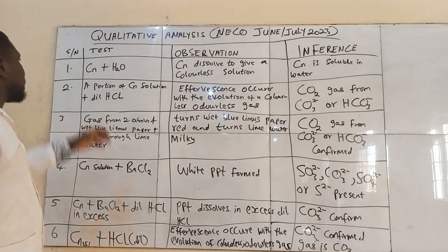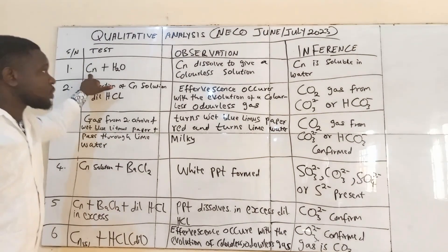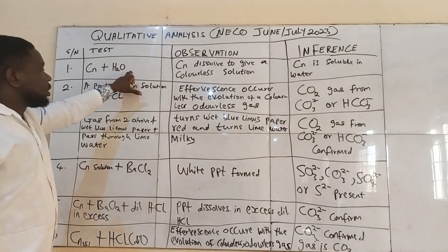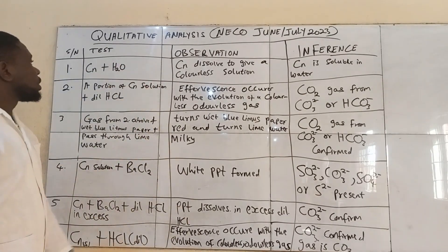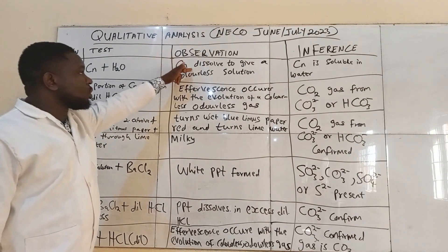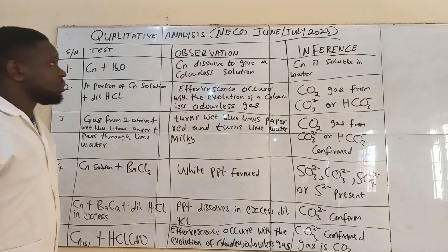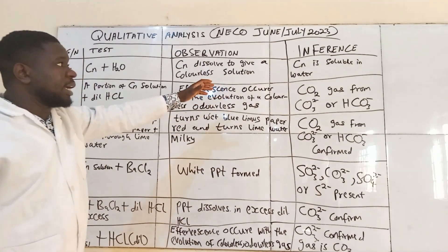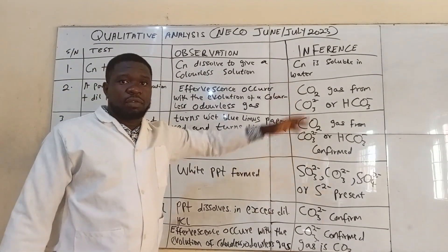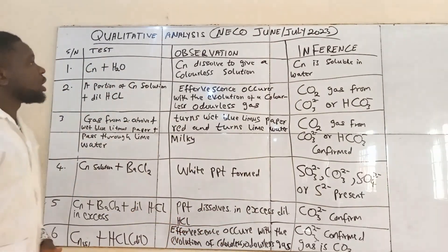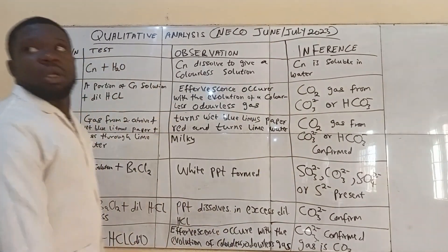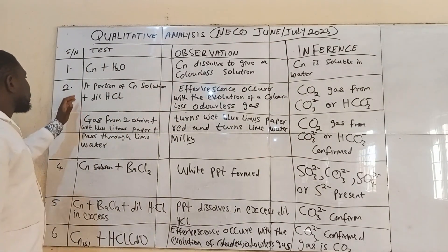In the first test, you bring a sample of the salt and then you add water to it and shake it to try to dissolve it. You will notice that the salt will dissolve in the water to give a colorless solution. The inference will be that the salt is soluble in water.